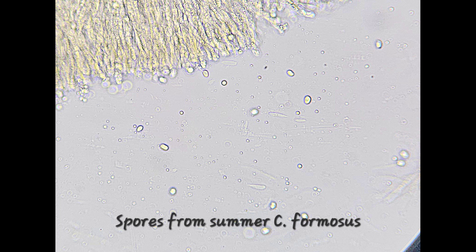I was excited to see the spores, so I just wanted to show you guys what it looks like when you're looking at the gill edge of a summer chanterelle in the microscope. Right here in this first picture, you can see the fungal tissue up in the upper left corner. And then all those little strands — those are actual hyphae. That is the fungus itself. The mycelium is made up of hyphae, those little strands of fungal material. At the very end of them, a lot of them are what are called sterile cells or cystidia. This is the region where basidia also grow right on the edge of growth, and that's where the spores get produced. You can see some spores that are kind of floating off in the liquid away from the fungal tissue — about 11 or 12 spores just in this super small little section of microscopy. This is at 400 times magnification.